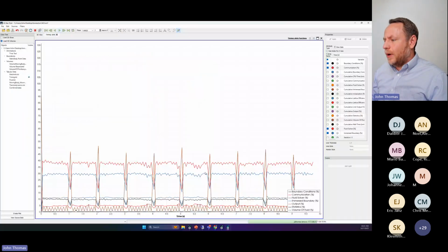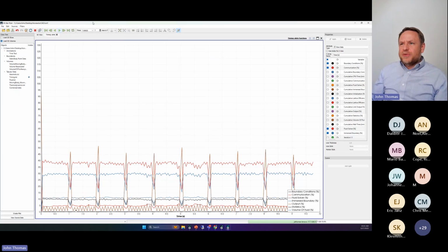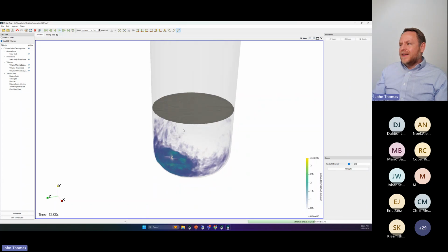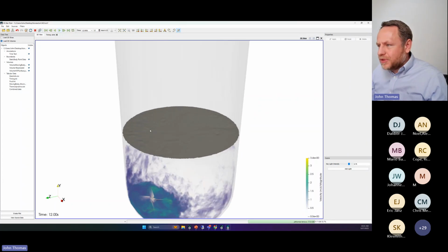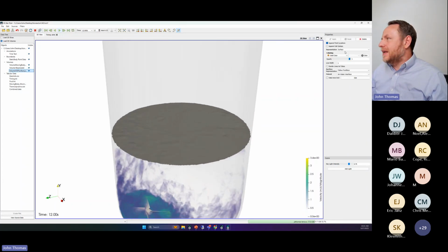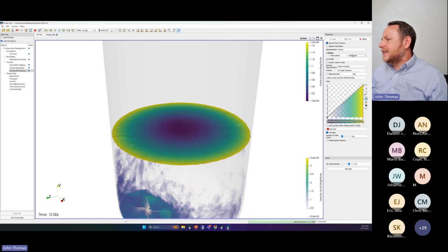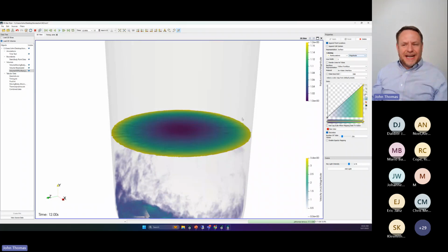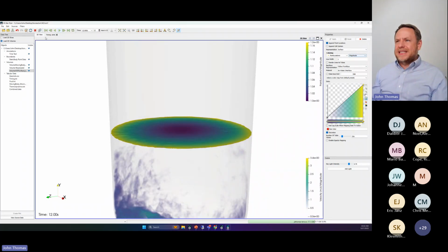Either way, back to this point here. If I don't need that VOF, I'm going to turn it off. And this is again more in the spirit of best practices. M-Star data comes out like that, so you can see right away what the model's giving you, what you're getting from it, and what physics you may be able to walk back on. I'm getting a little bit of wobbles here in the free surface, a little bit of motion, but gee whiz, guys, it's not worth 30% of my runtime.